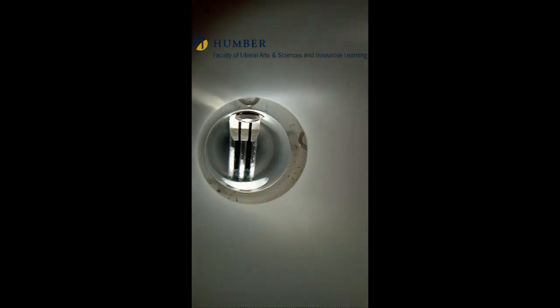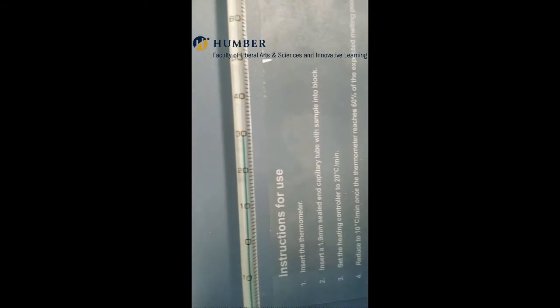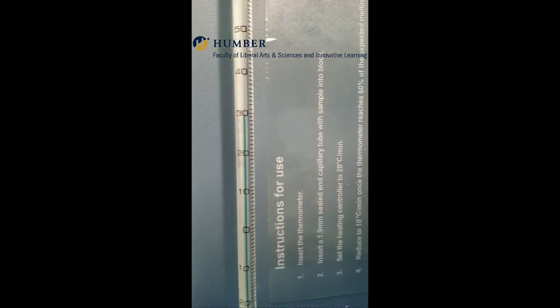Start the heating by turning the dial switch. Check the temperature — the increase is seen to be 30 degrees centigrade.